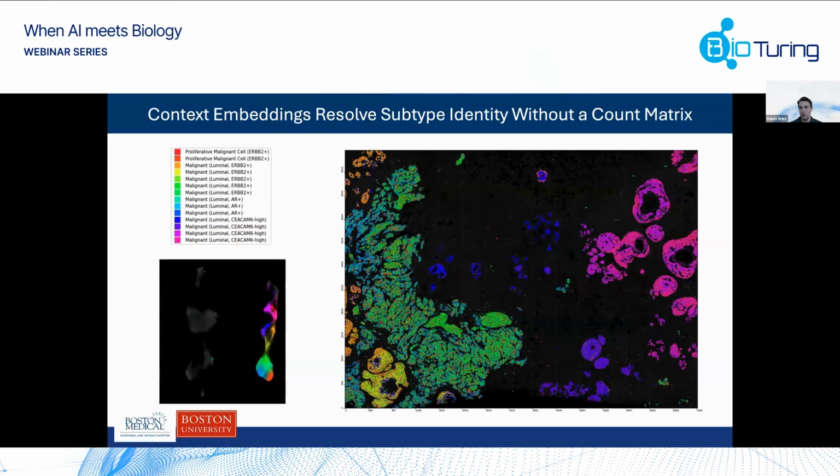You can even go further, and it's pretty good at identifying really small subtypes. For example, here we're subtyping only the malignant cells, only the breast cancer cells, not all the other data. And you can nicely see all these spatially informed subtypes of breast cancer, based on the local correlation landscape, which I think is pretty impressive, that you can do all of this with minimal coding and with minimal human interference.